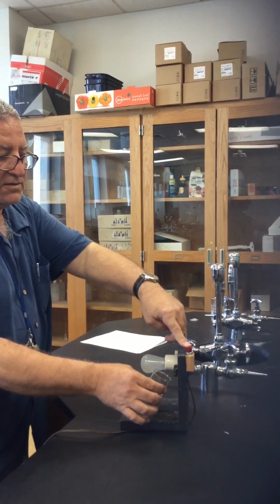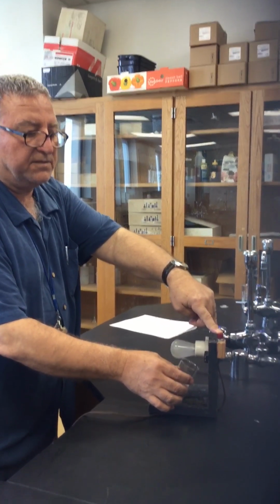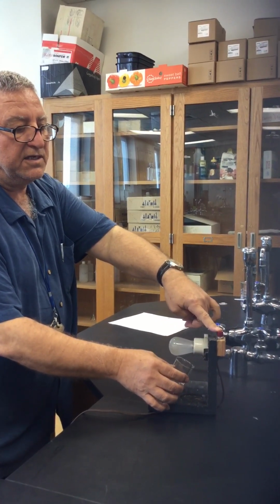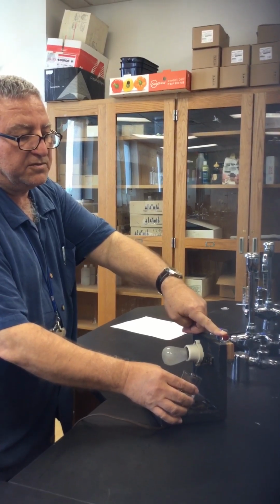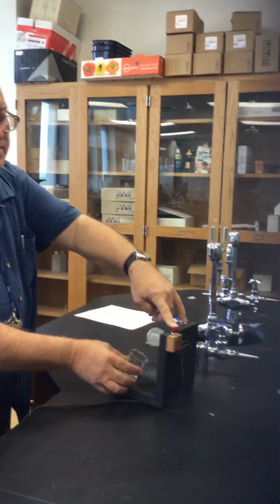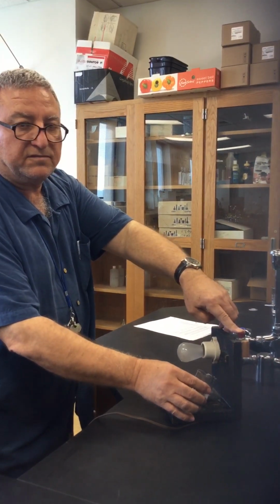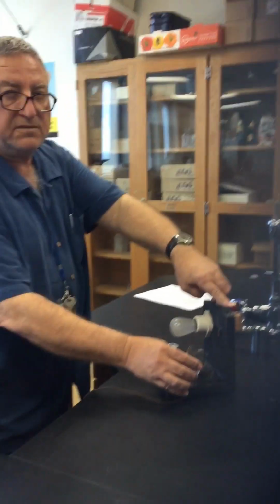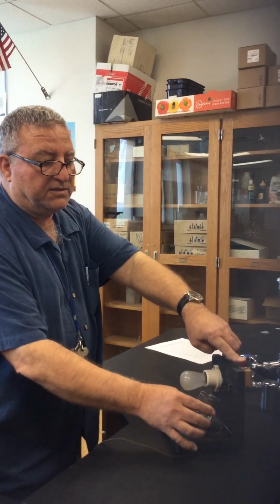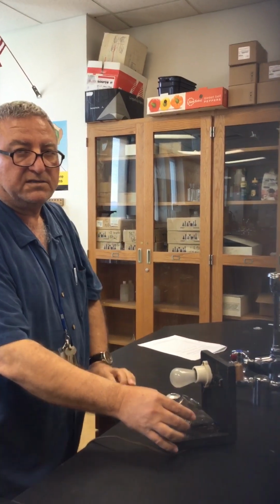That's because the distilled water does not have any ions to conduct the electricity. This is a very simple, handmade machine. It's just two pieces of wire and an electric cord with a light bulb. You can look from the back as well. So that's an indication that there is no conduction of electricity here. The light does not come on. That's qualitative. It tells you that the distilled water is a non-electrolyte, does not conduct electricity.